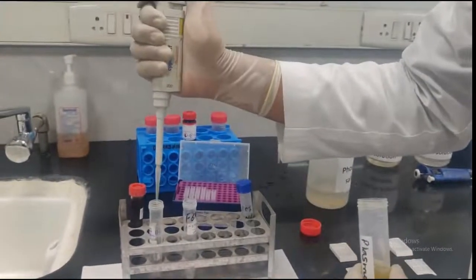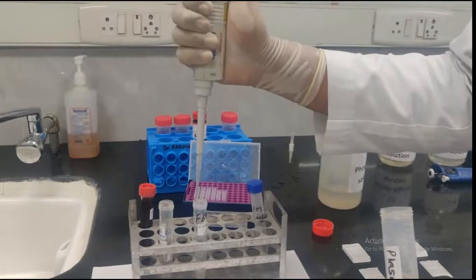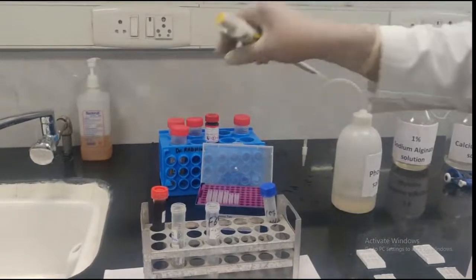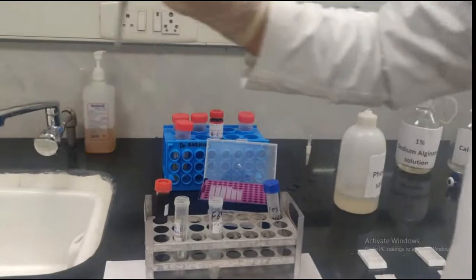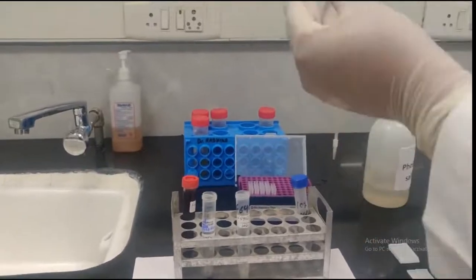The basic principle in this technique is to add plasma and thrombin to the cell pellet so as to obtain a clot that will enmesh the material or the cells within it. So now we have added plasma. After adding plasma, we will add thrombin.